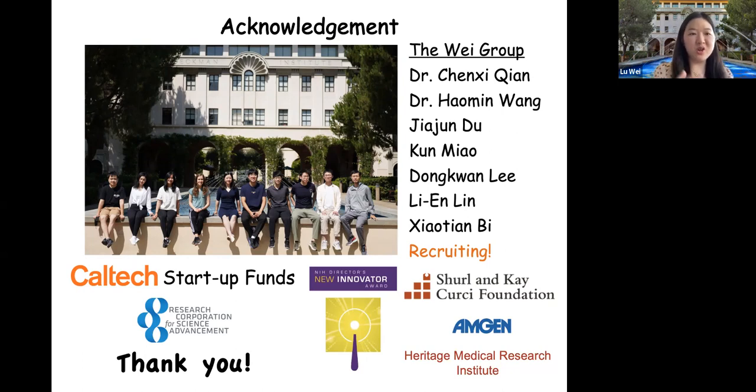But I think for longer periods, unavoidably, we're going to introduce some photo damage, because although we're trying to minimize it, once you start to observe them, you're going to perturb them, right? So the short answer is that if we image every couple of hours, we can do it for a couple of days. I think 3 days is what we have tried, but longer than that, we have not really tried.